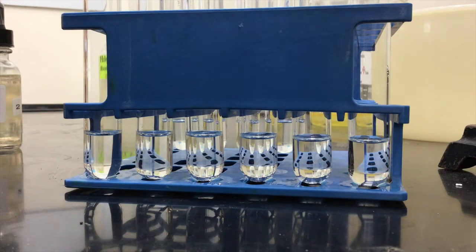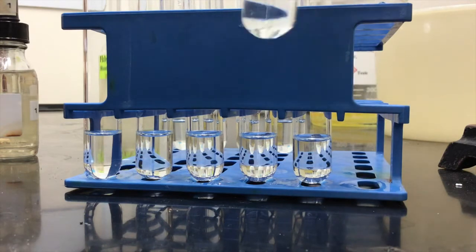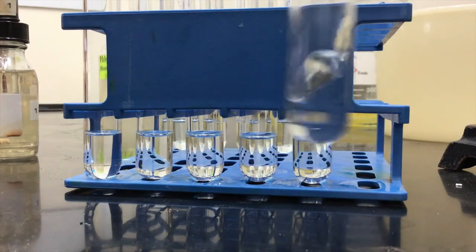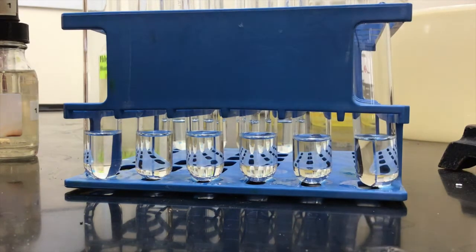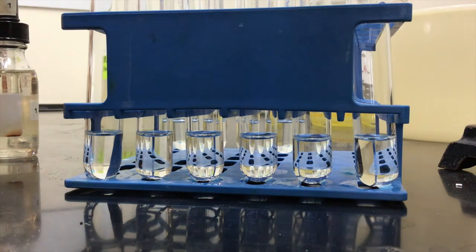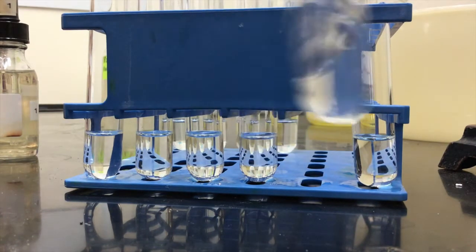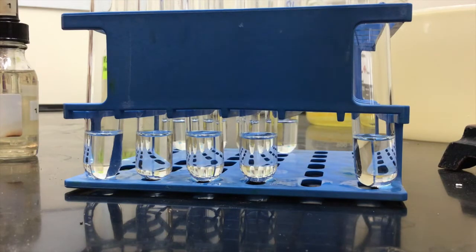So this is 2-chlorobutane. 1, 2, 3, 4. And we're going to give it a little shaky shake. Okay. Now we're doing 2-bromobutane. 1, 2, 3, 4 or so. A little shaky shake.